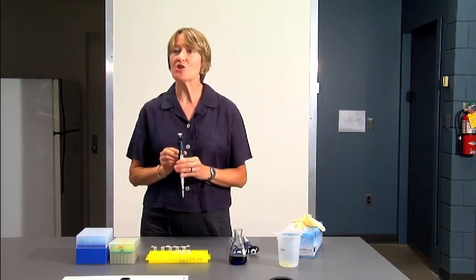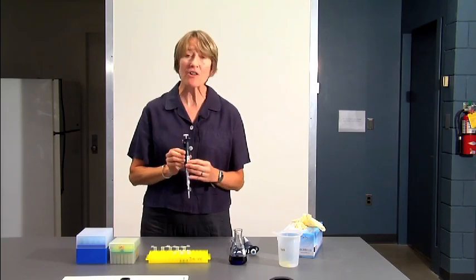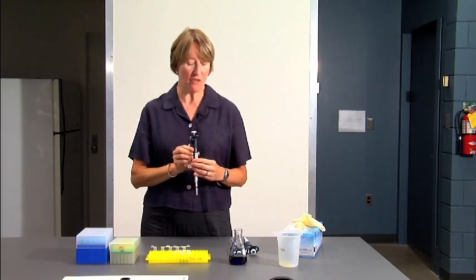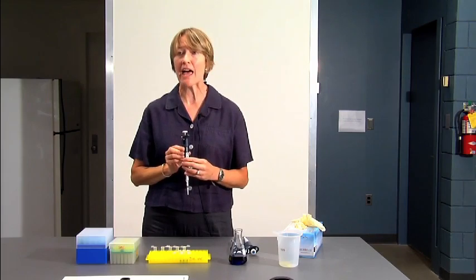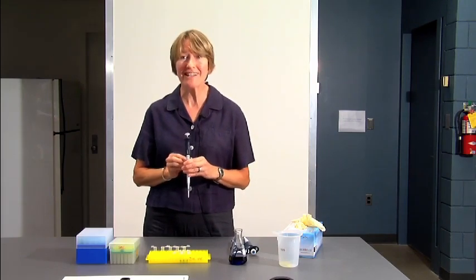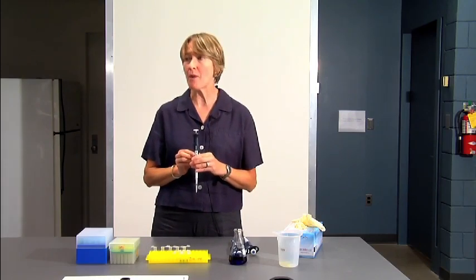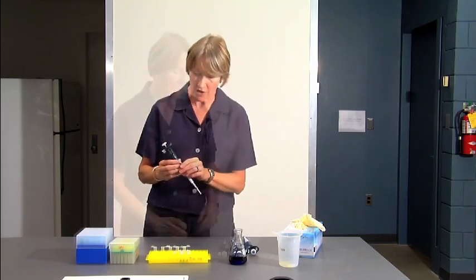Just for your information, your lab manual in the appendix also has the directions for how to set the pipettes, and it also has diagrams of each of the pipettes. So if you need that, you can look at that in lab and remind yourself how these pipettes should be set. It's very important to set the pipette correctly, or else you might be pipetting the wrong amount of liquid, and therefore your biochemical reaction is not going to work very well.